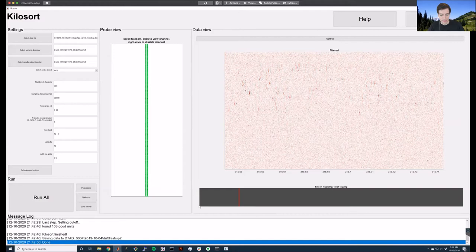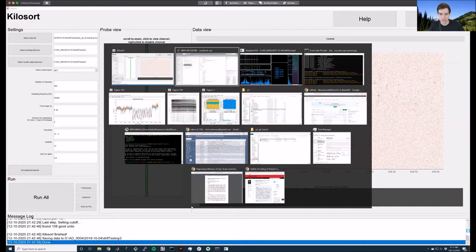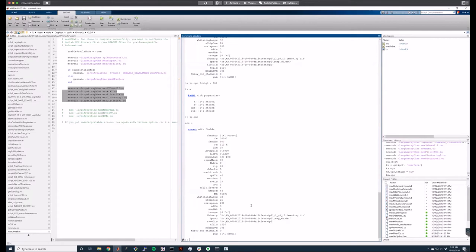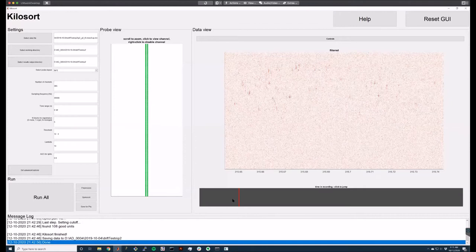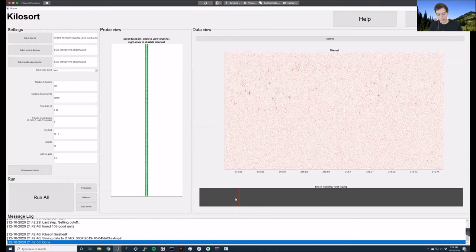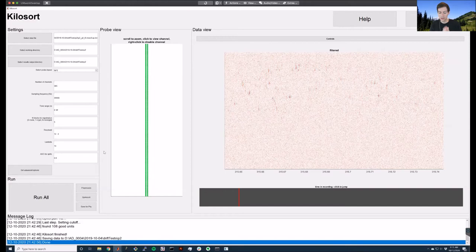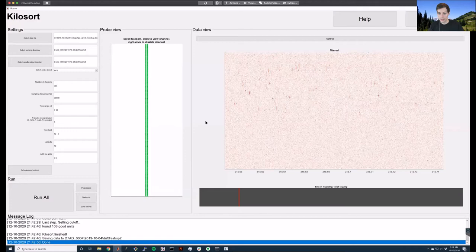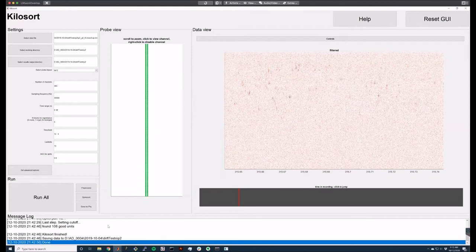Regarding the filtered view output — that is a result of preprocessing. The full preprocessing step takes about five minutes, but the GUI runs a very shortened version immediately that takes about 10 seconds. When you load your data file it will run that shortened preprocessing so it can show you the filtered and whitened data right away, before you run anything. It won't be able to show you the prediction and residual until after you run everything, but it will show you both raw and filtered immediately.